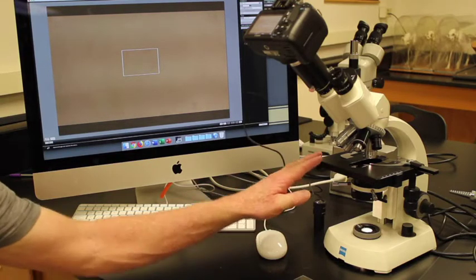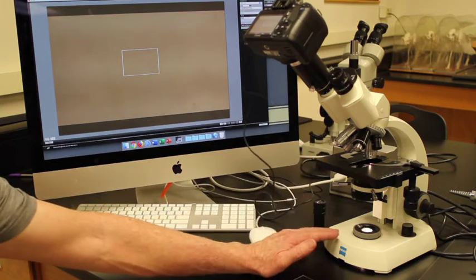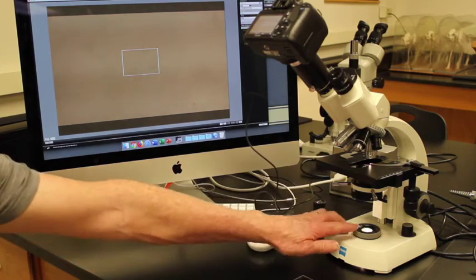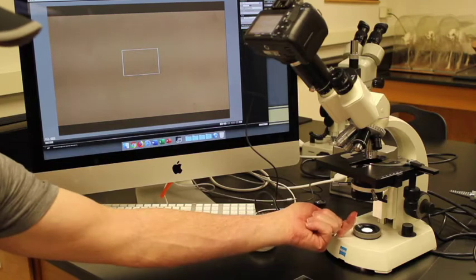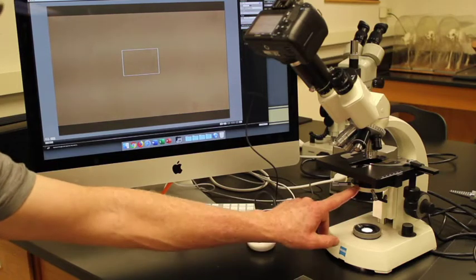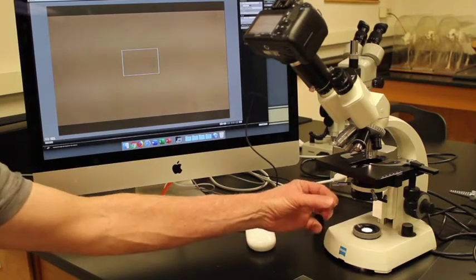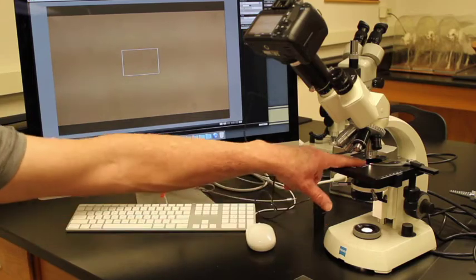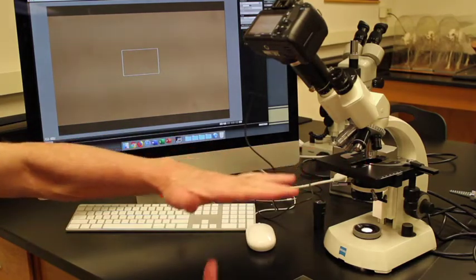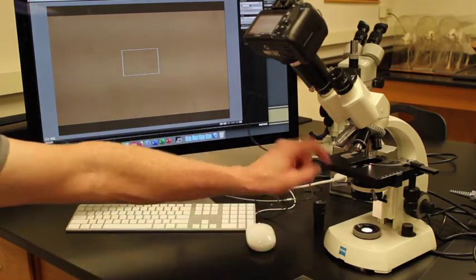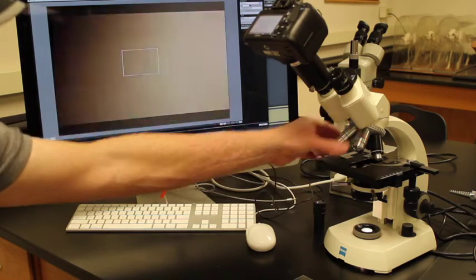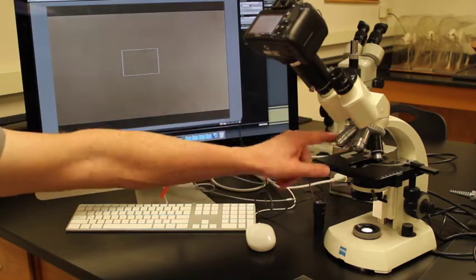This is the microscope we'll be using. This is a brightfield microscope. Brightfield microscopes begin at the bottom with a light source. The light source shines light up through the sub-stage. There's a condenser that basically focuses light. The light passes through an object, then goes directly through.